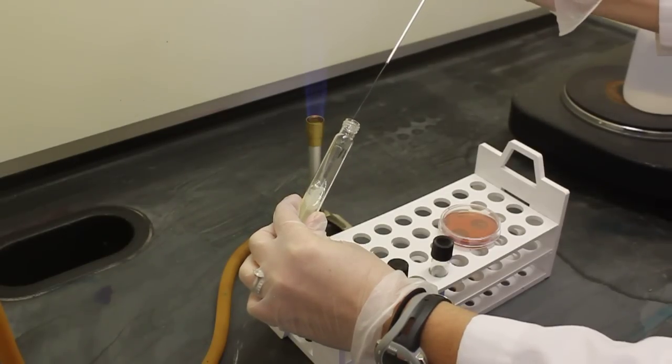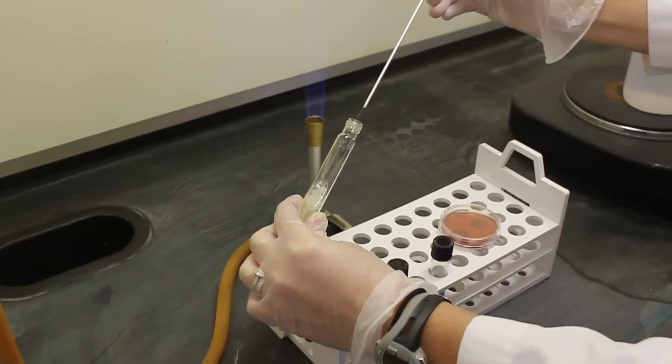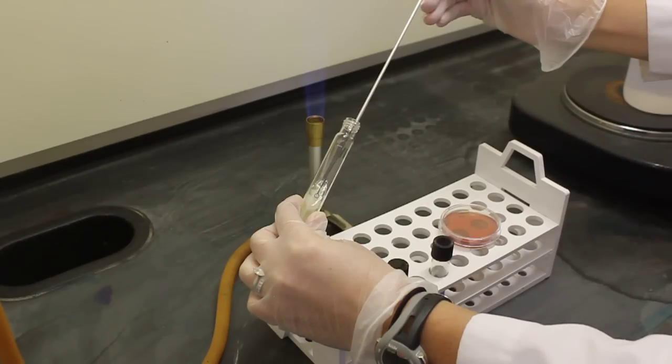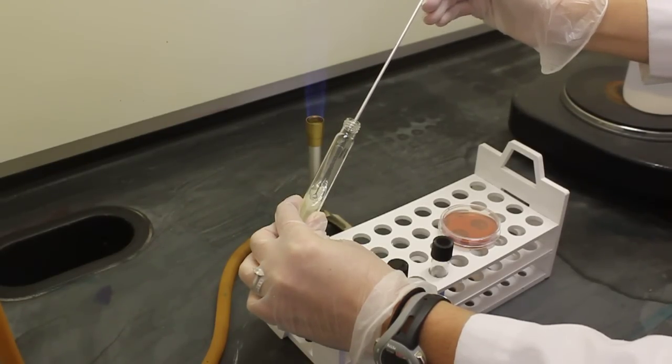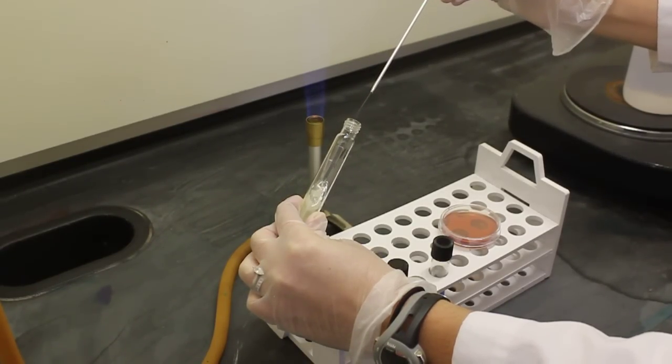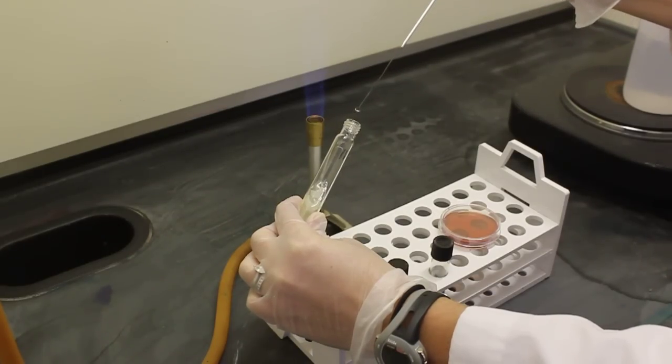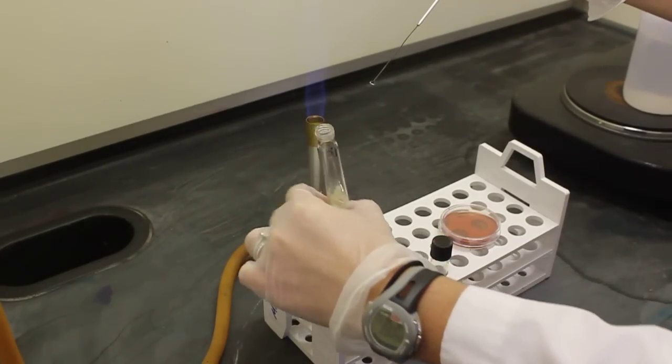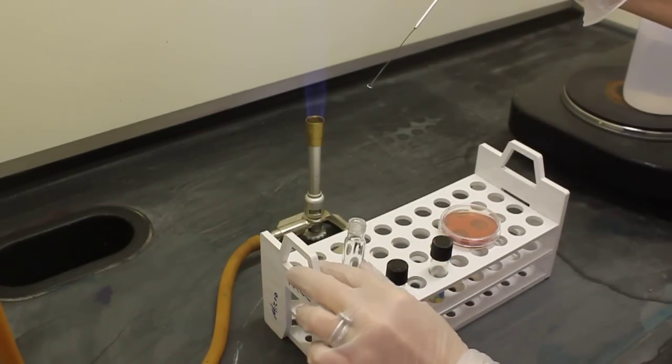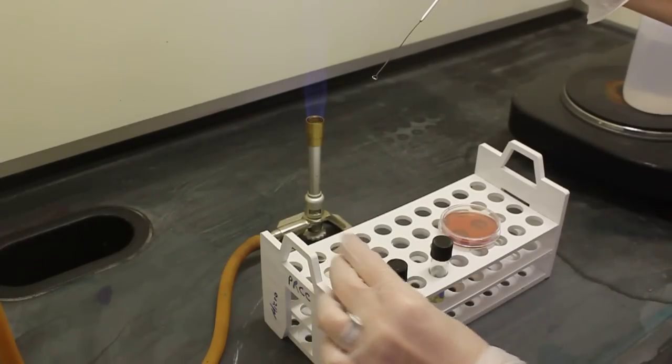Now that my loop is sterile, I will dip into my stock culture just touching the top where the bacteria is. I do not dig down into the media. Notice I do not touch the sides of the tube as I come out. Sterilize the stock culture lid.